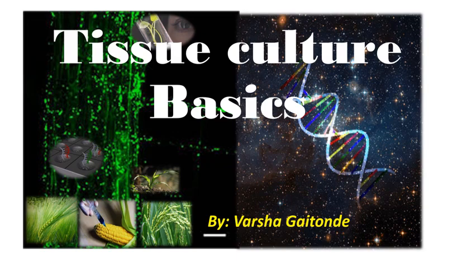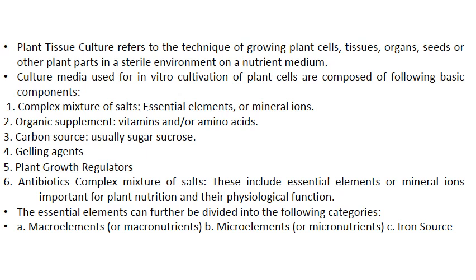I am Varsha Gaitonde and this video is about tissue culture basics. As you know, tissue culture refers to the technique of growing plant cells, tissues, organs, seeds or other plant parts in a sterile environment on a nutrient medium.